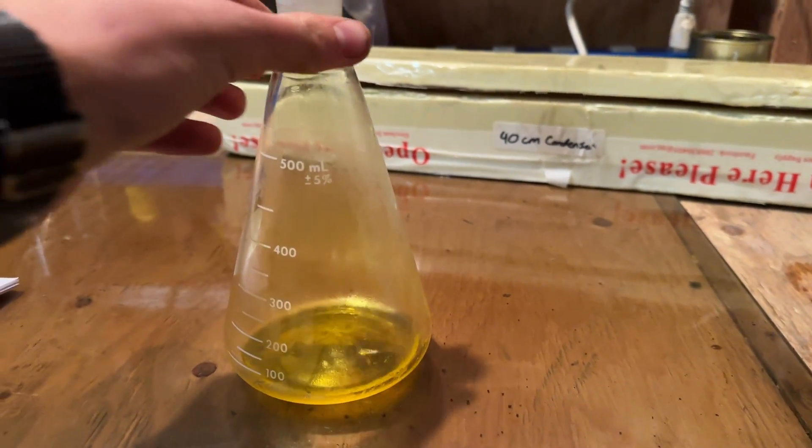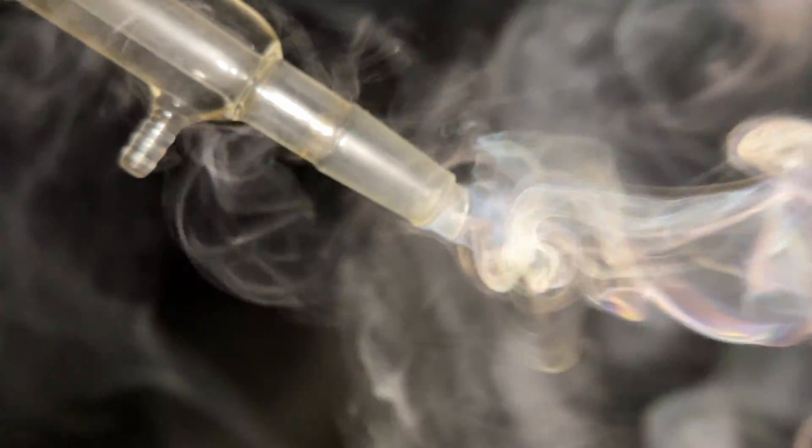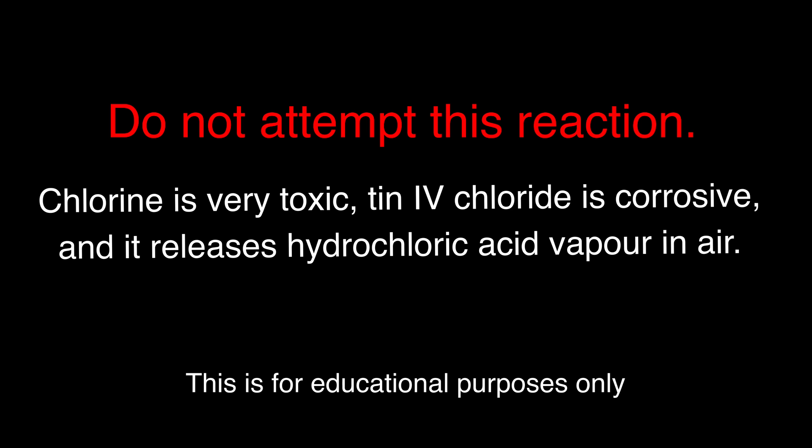Hey guys and welcome back to another video. Today we will be producing some tin-4 chloride from finely divided tin and chlorine gas. Tin-4 chloride is a very corrosive fuming liquid which we will hopefully use in the synthesis of sulfur trioxide. As a side note, do not attempt this reaction. Chlorine gas is highly toxic and tin-4 chloride is very corrosive — it also fumes profusely in air, forming hydrochloric acid vapor.